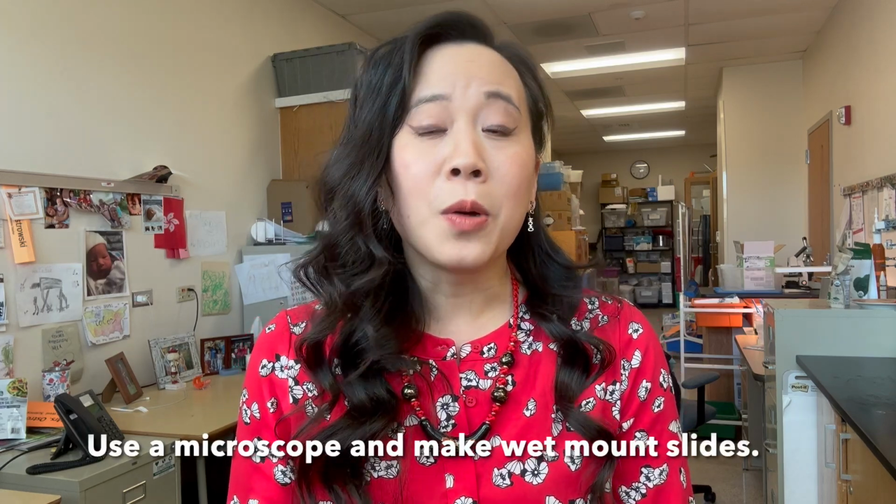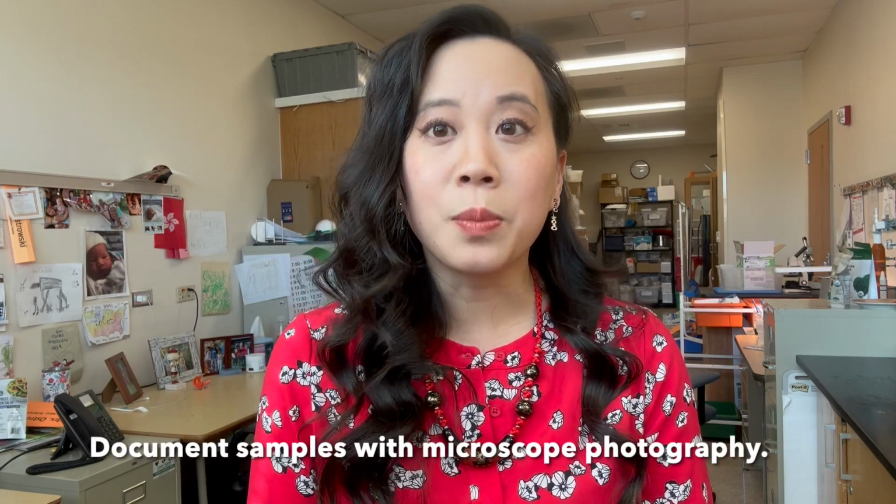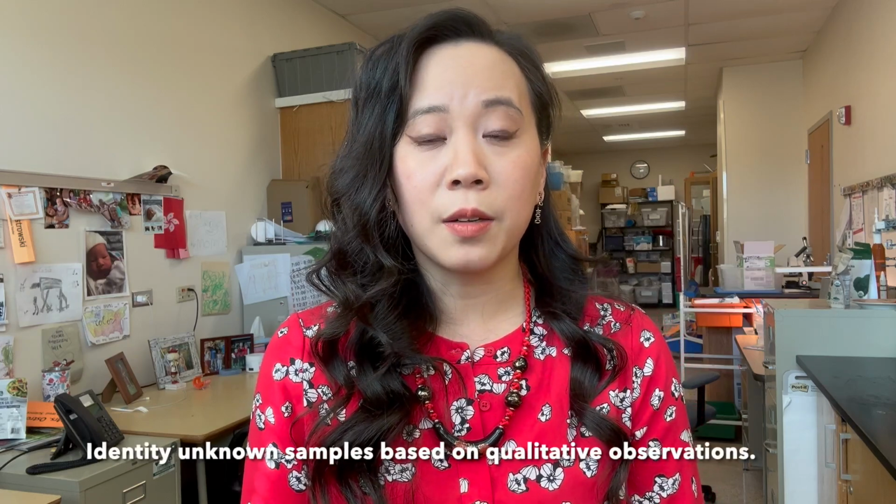Hi, we're going to be wrapping up the biology unit with a lab practical. For this lab practical, you are going to be assessed on your ability to use a microscope and make wet mount slides of samples and document what you see in the microscope using microscope photography. In addition, you need to be able to identify samples based on qualitative observations that we will provide for you.